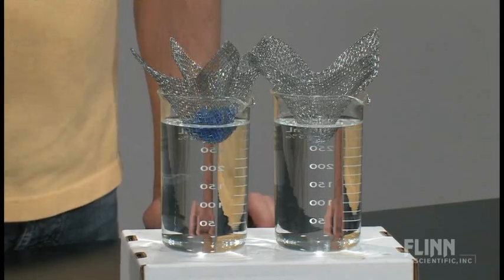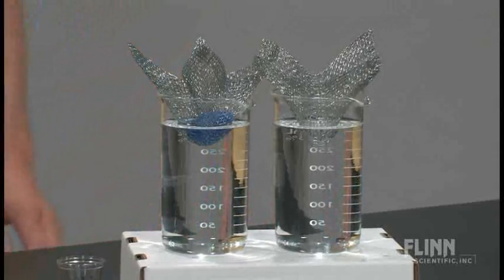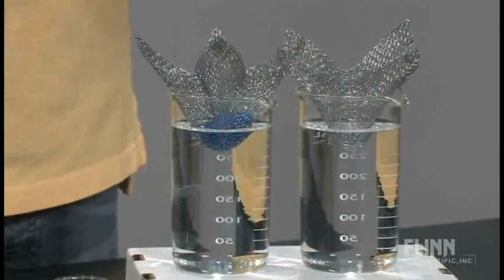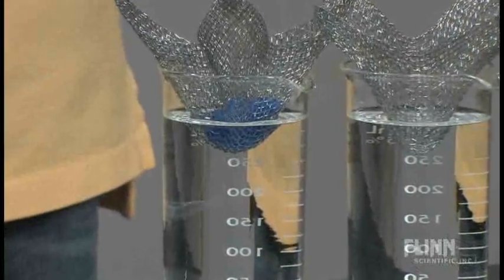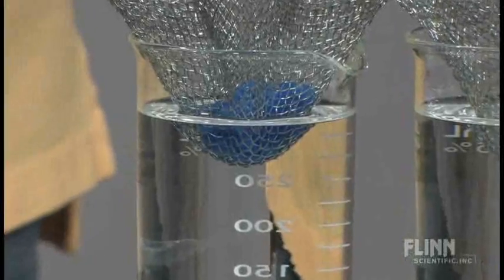When you pour the copper sulfate in, when it first goes in, you don't see much of a reaction at all. In fact, it almost looks like nothing happens. This is a really slow reaction, partly due to the surface area, partly due to the slightly limited solubility of copper sulfate. It's just not a fast dissolving compound and it's not fast to react.